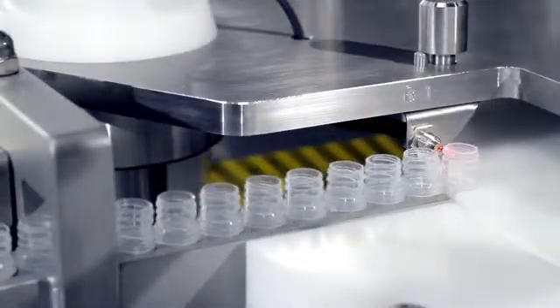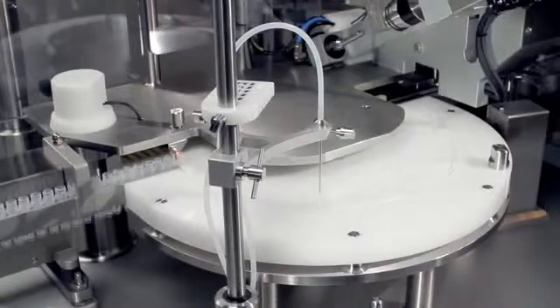Microtubes are fed into a filling station from a customized vibrator bowl and chute. A peristaltic filler ensures accurate filling and prevents costly overfills even on fill volumes less than 0.2 milliliters.